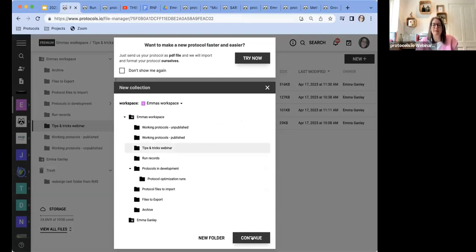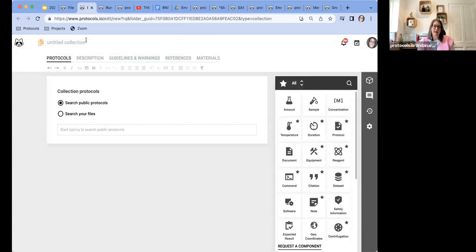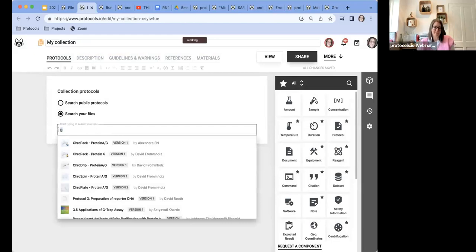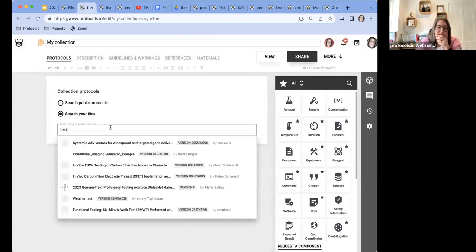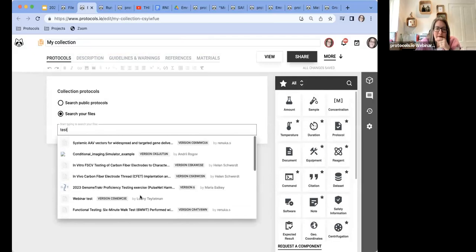We'll pop it into my webinar test folder, and then you can just call it my collection, search public, let's search my files. These are things people have either shared with me or my files.